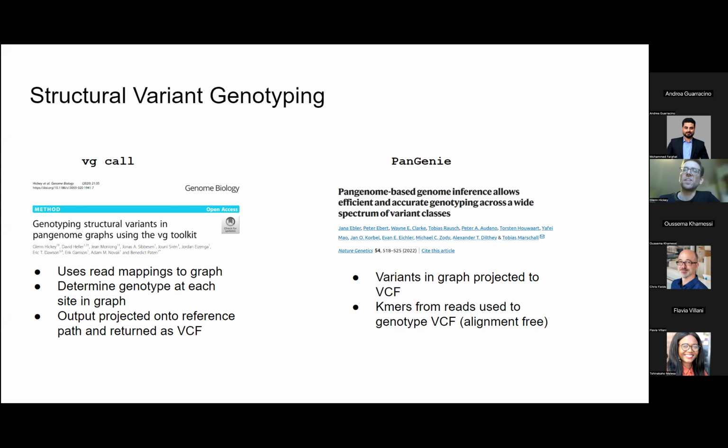If you're genotyping a sample and your graph contains many variants that aren't in that sample, those variants usually aren't helping you. So this is a way of getting around that. Working on long read Giraffe, the centromere alignment is obviously an active thing. We have someone working on that. The goal is to have an option to add the centromere alignments to the graphs one day.